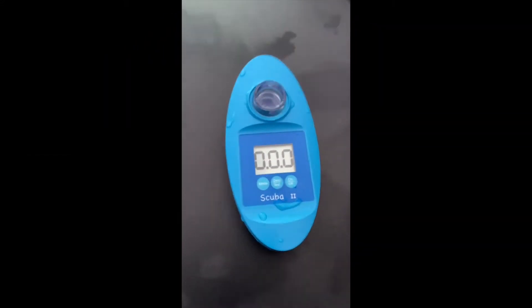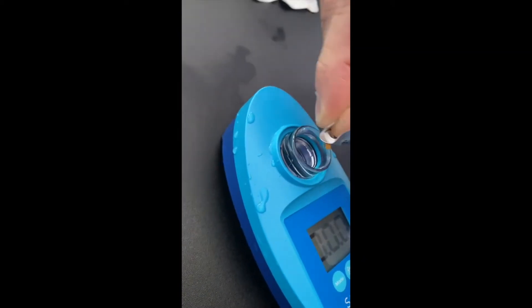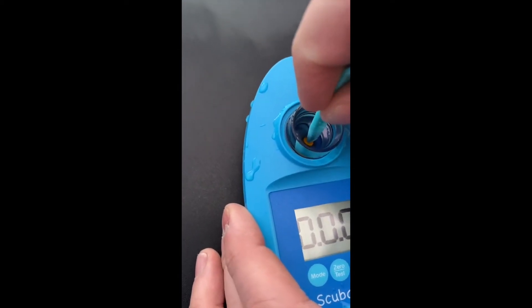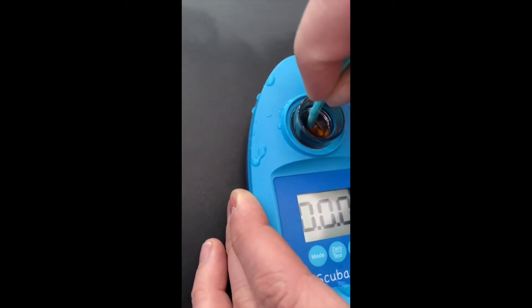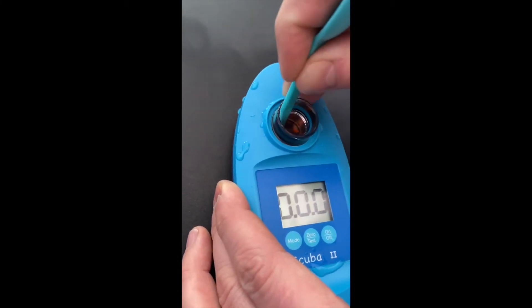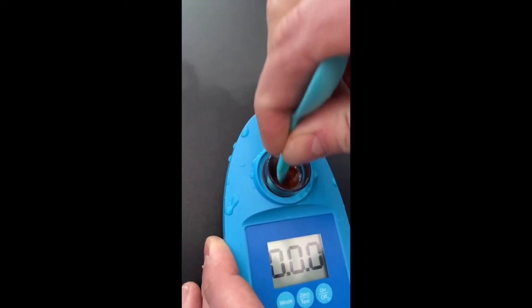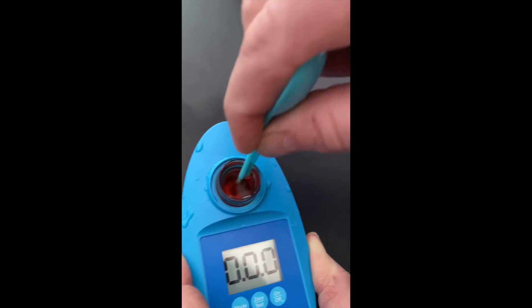We're going to first test the pH level. On this particular one we're going to use the phenol red. The first thing we need to do is squeeze the tablet out so that it drops in, as you can see, and then we need to crush the tablet using the plastic stirrer that comes with it. That's a little bit fiddly to begin with but, as you can see, we're just doing that now. Make sure it's all crushed up and then stir it to make sure it's all dissolved.